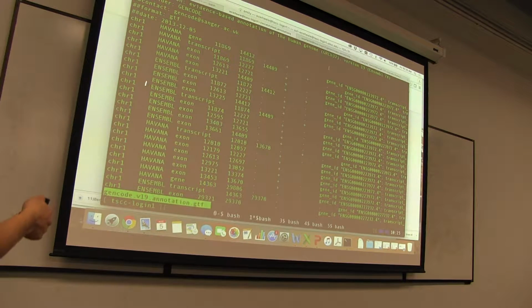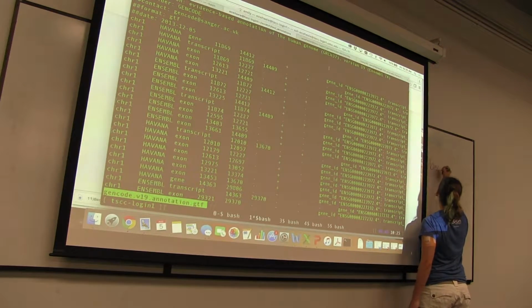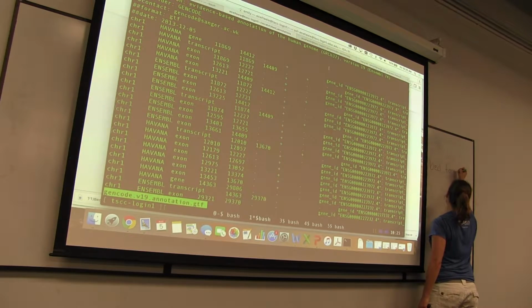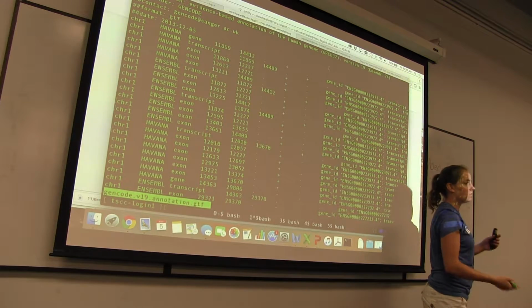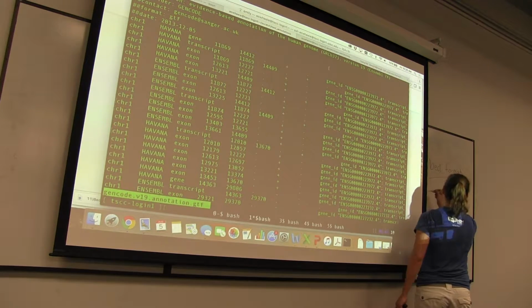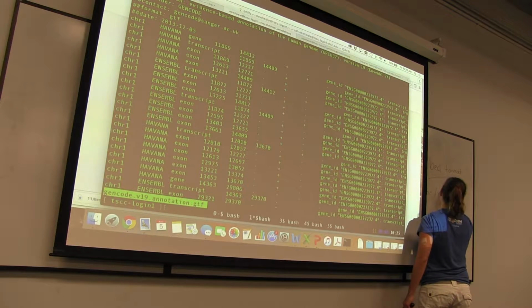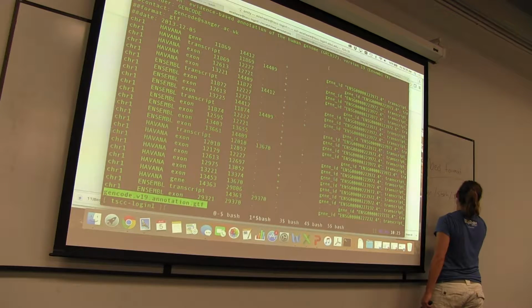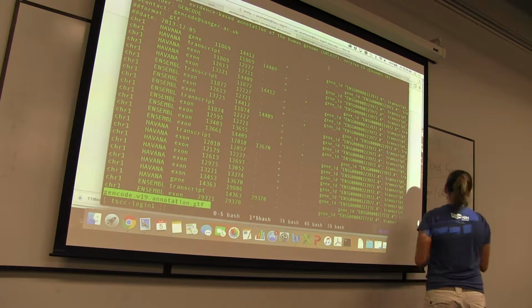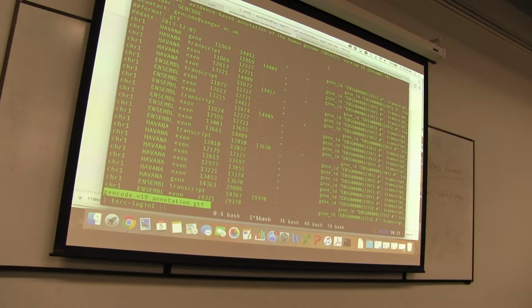So the standard of this, and this is where we're getting into files in the BED format, I mentioned on day 1. This is a useful universal file format for looking at regions of genomes. The standard is always a tab-separated file. You're going to have chromosome, start, stop, plus other stuff.